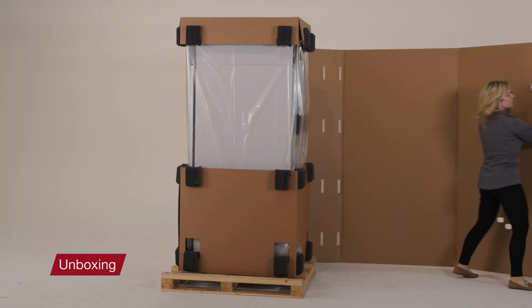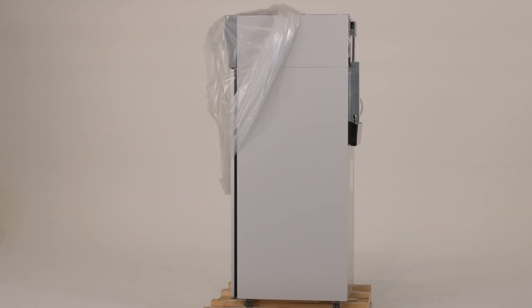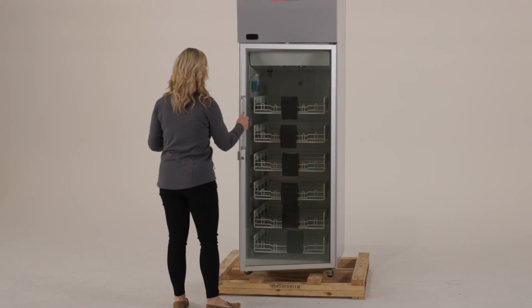Remove the outer packaging and kick plates from the refrigerator. Remove any packaging blocking access to the interior of the unit. Remove any shelves, casters, and other accessories from inside the unit.